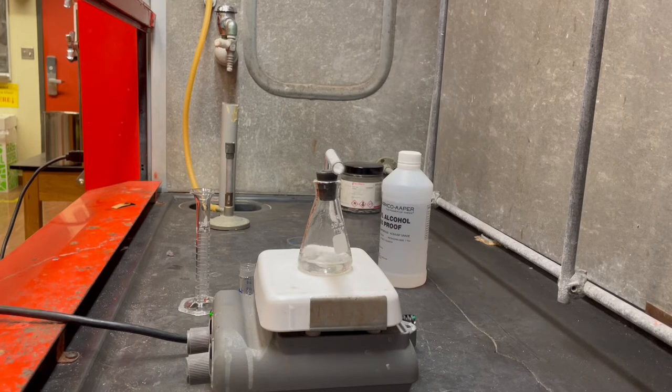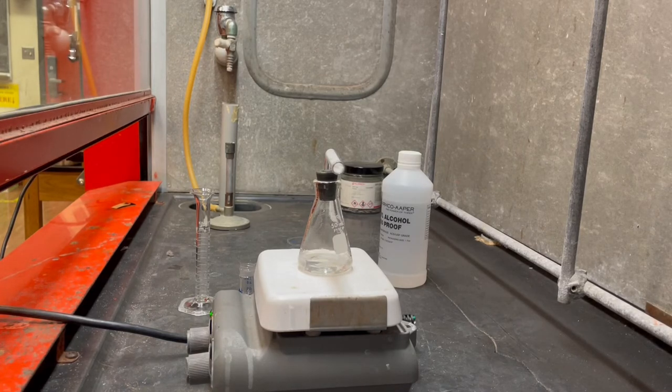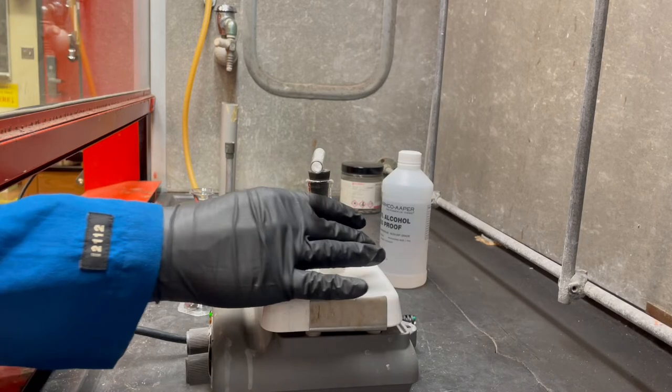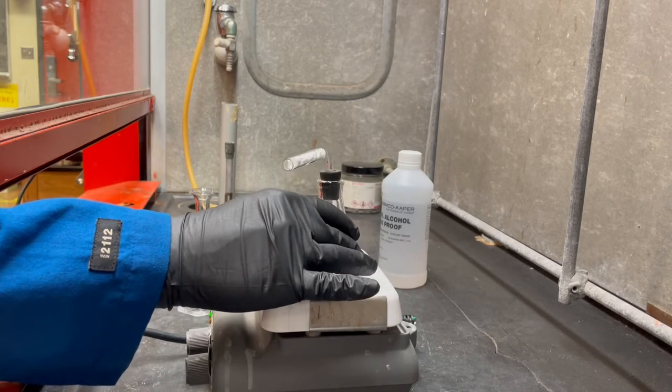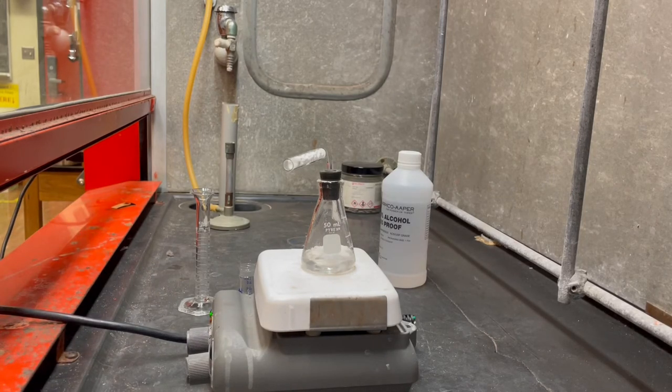But, yeah, the goal is to really see if we can get all of that sodium to dissolve. And then that's when we know we have all of our sodium ethoxide, at least enough formed for our reaction. What I might end up doing if it takes too long is, if we have a little bit of sodium floating around, that's actually not too bad. I'm down for that because that means it either didn't react and it's still reacting, or it's just chilling there and any water that's trying to get in there will just react with it quickly. And so I'm thinking of it as almost like a protection layer. You know what I mean?